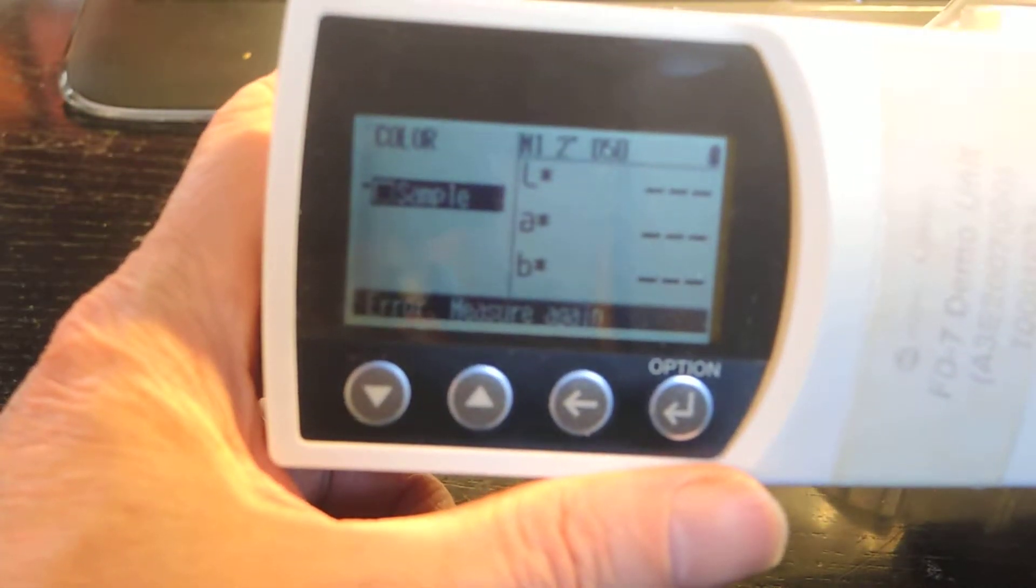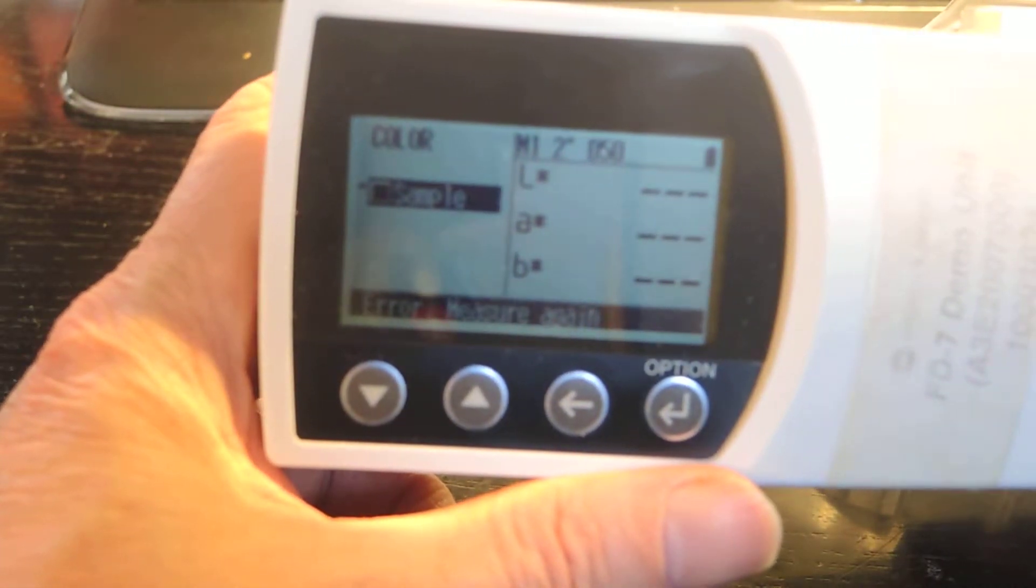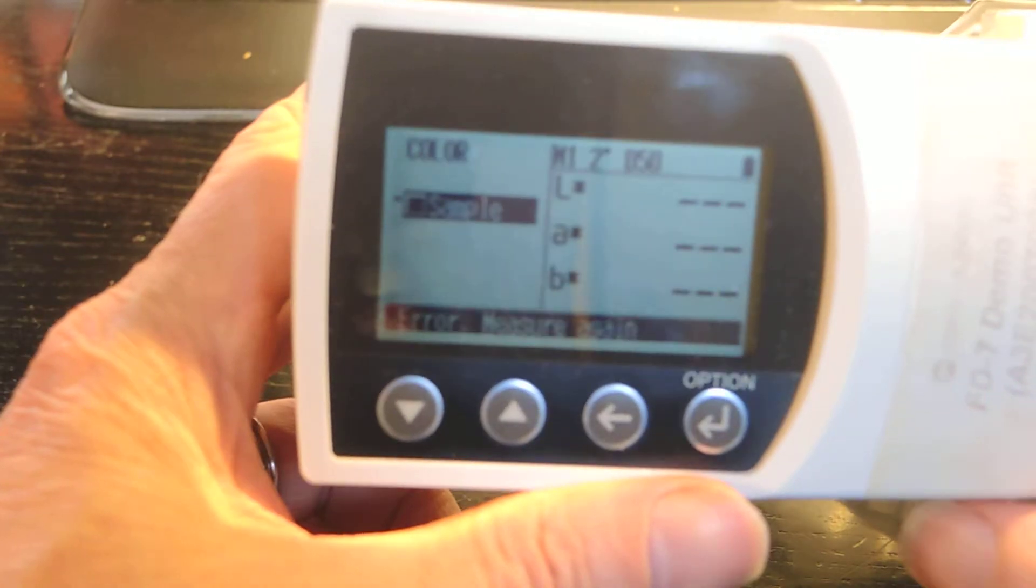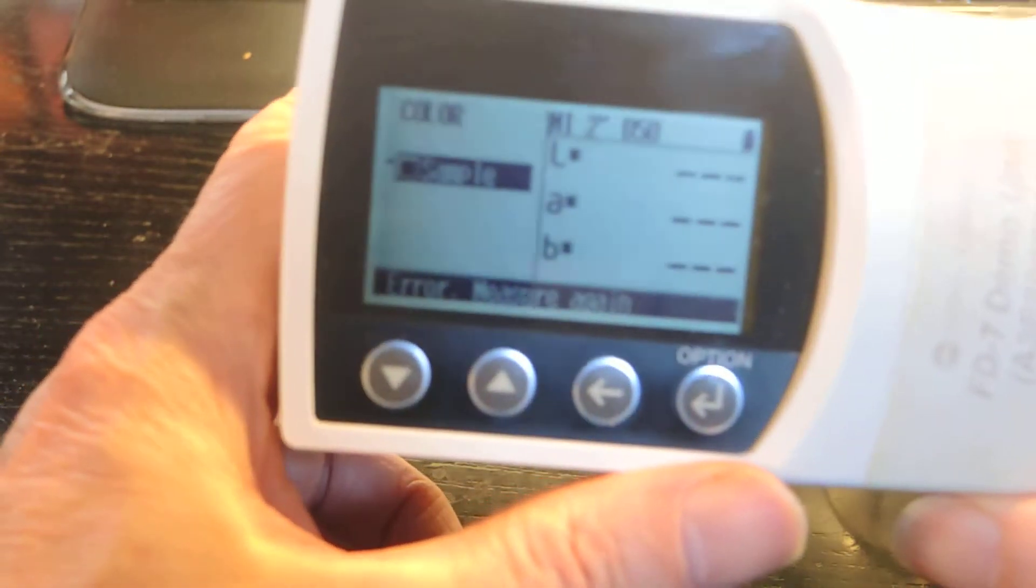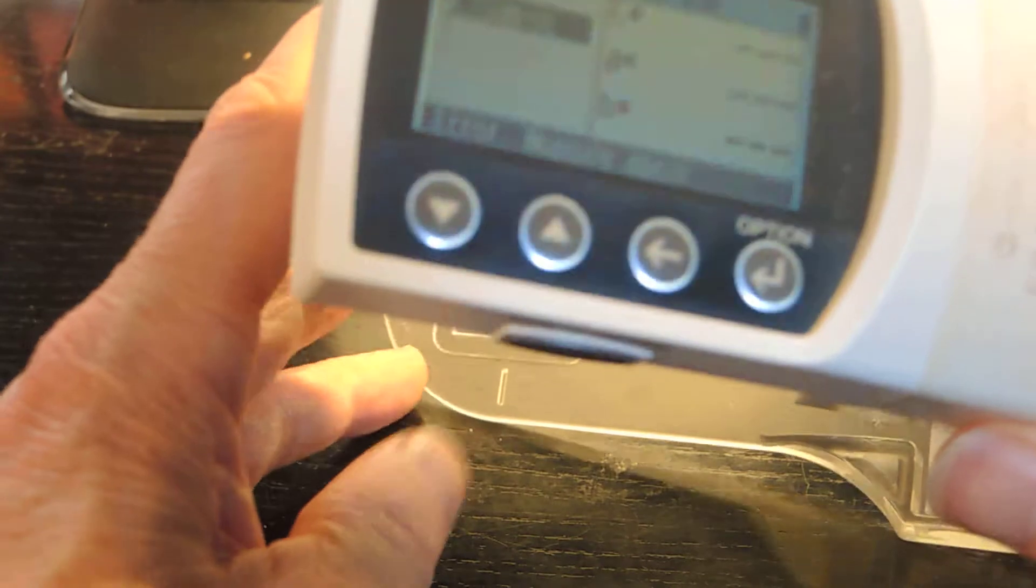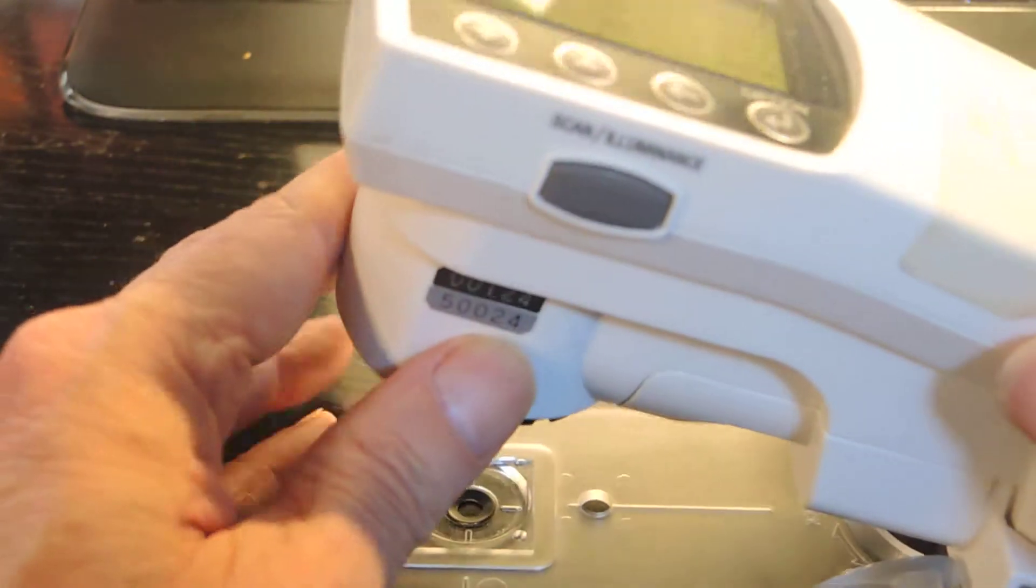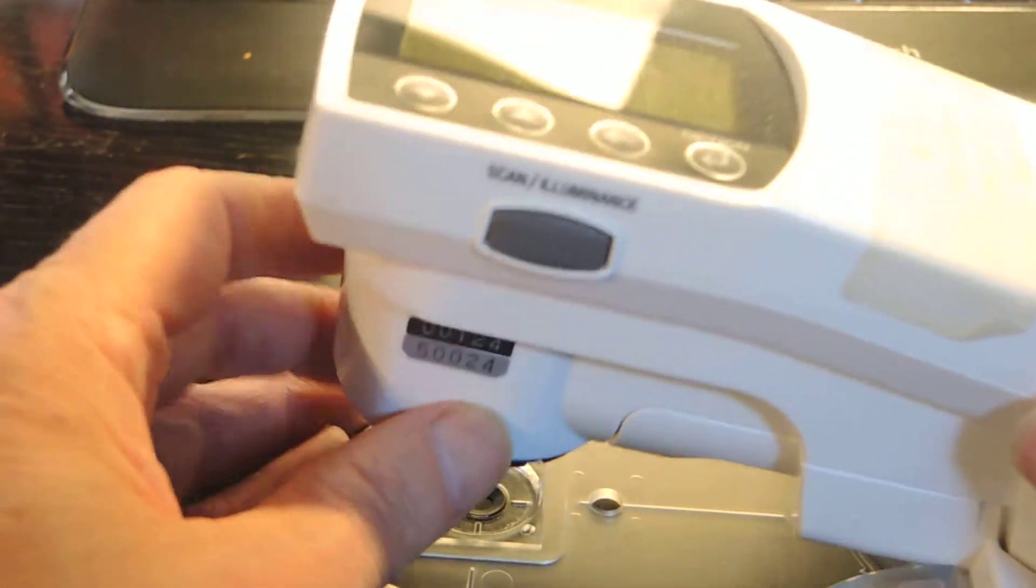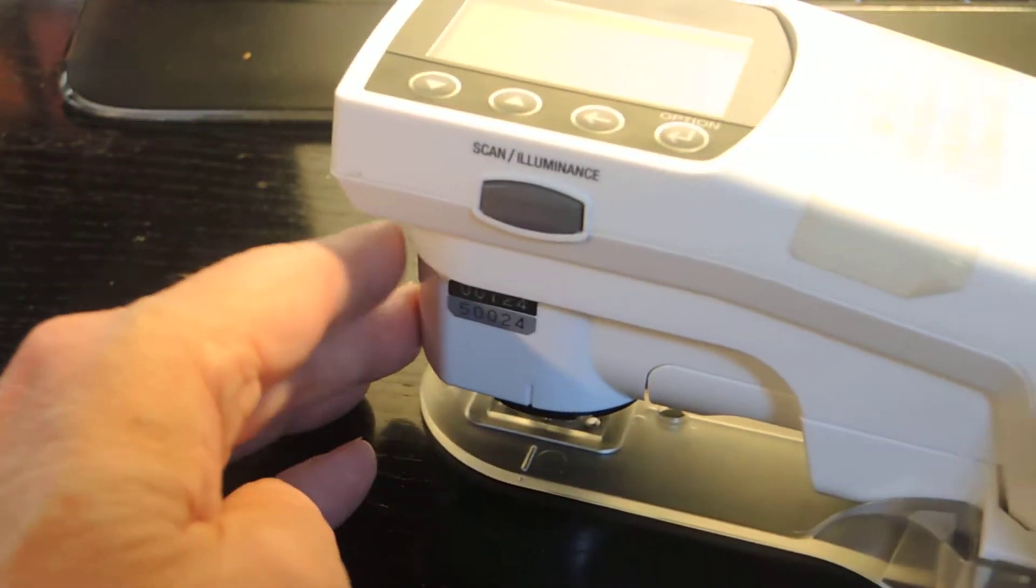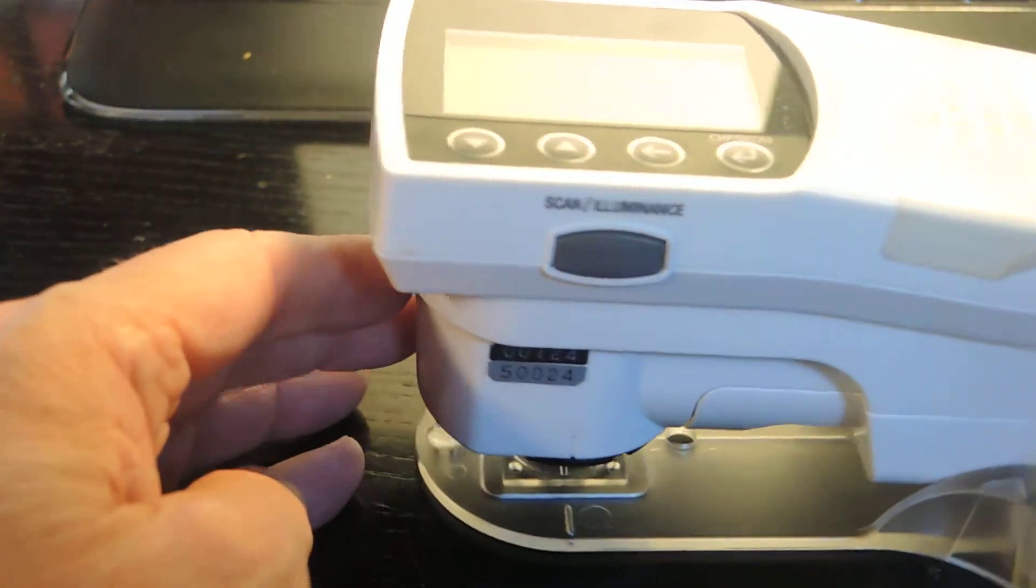Okay, here we go for another video of the FD7. I'm not sure how far I'm going to be able to go this time, but I wanted to try taking this video with a different kind of equipment.